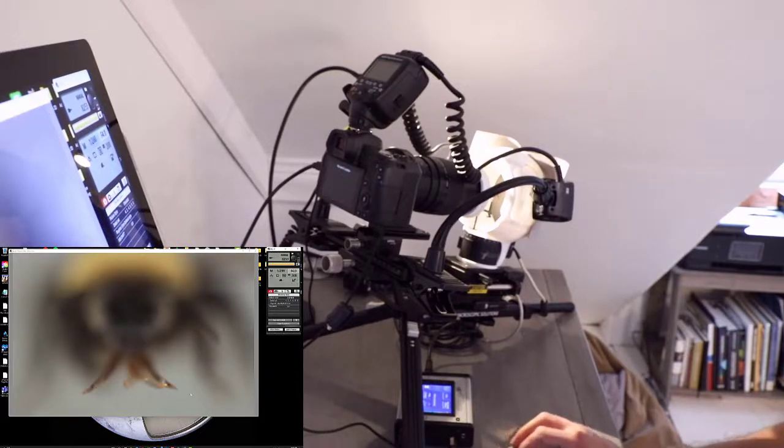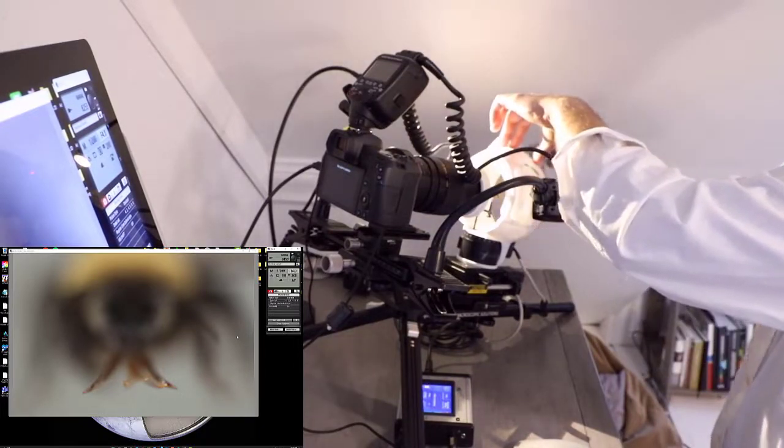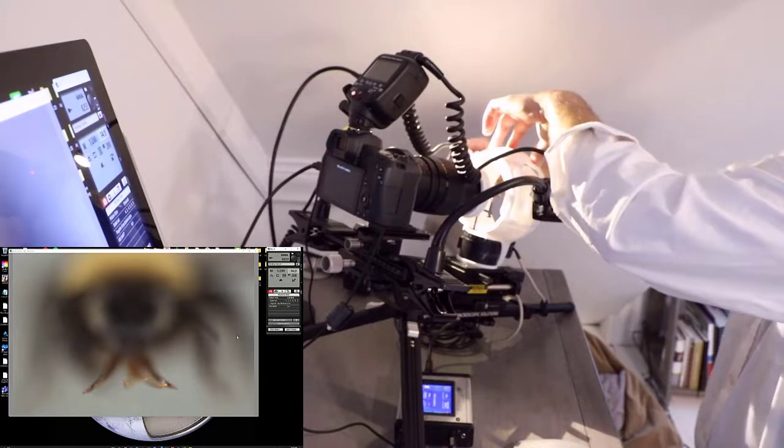Okay, and I can just tell that the light is pretty good without having the specimen in focus. I can tell that there are going to be some areas like the hairs and the head that are going to be quite dark in color. One way we can just test that, we'll take off the background here for a second in order to get a really dark background.